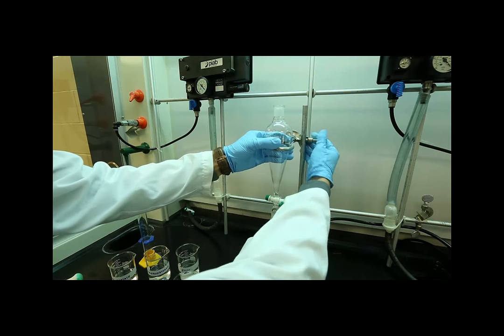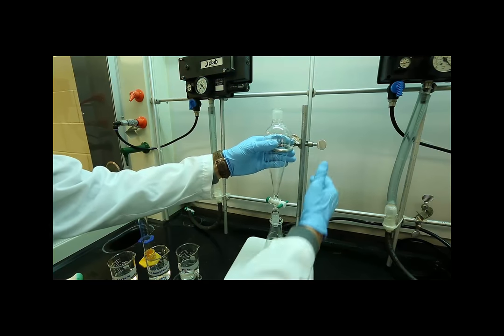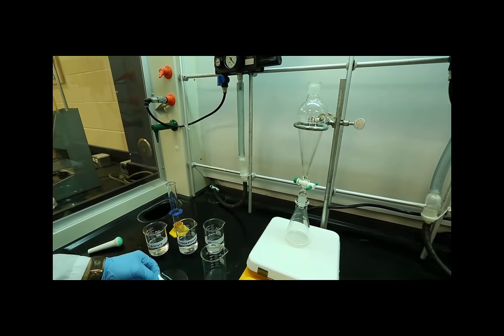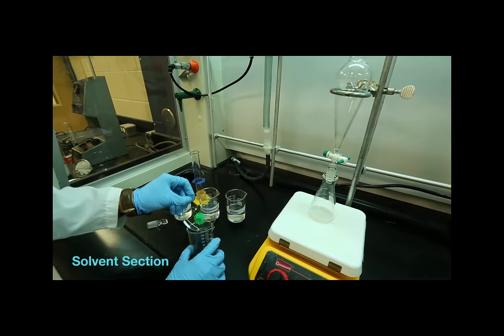Now let's consider what happens during a washing. In this example, we have a sample which is comprised of a blue compound and a yellow compound.